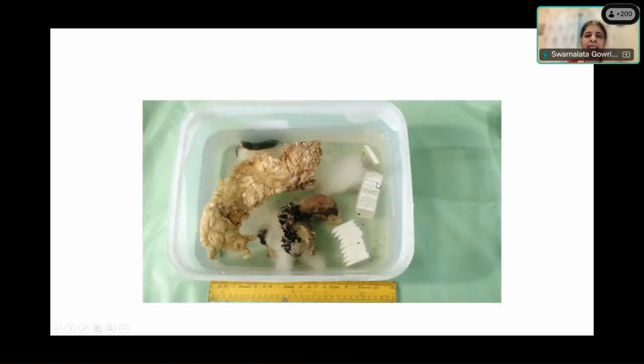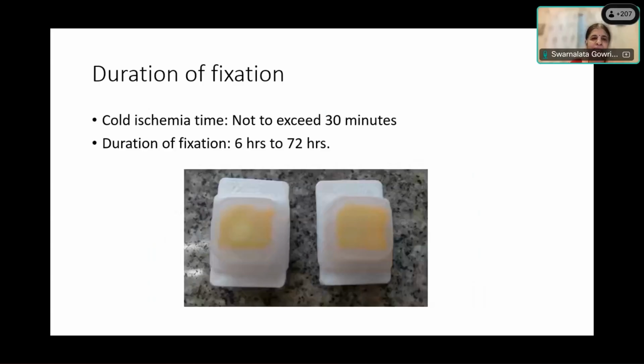Having taken some representative bits, if you do not gross them the same day, you're going to keep them because some more sections need to be taken. You can put them in the same container with adequate fixative, and close it tightly so that the formalin doesn't leak. And I forgot to tell you that your grossing room should be adequately ventilated. You should have very powerful exhausts which will drive away the fumes so that people stepping in will not even know that it is a grossing lab.